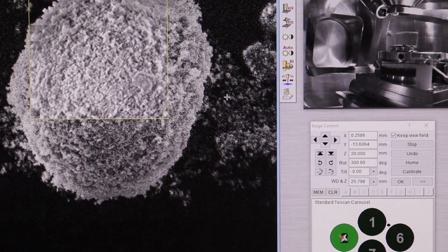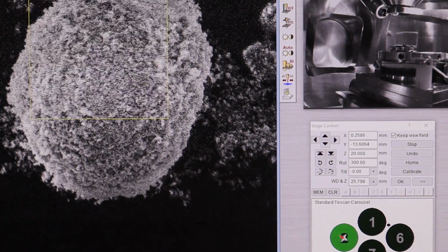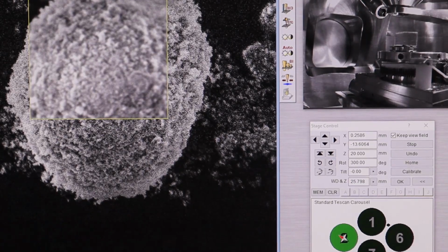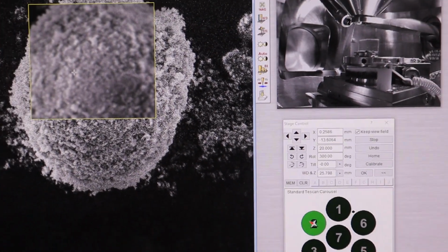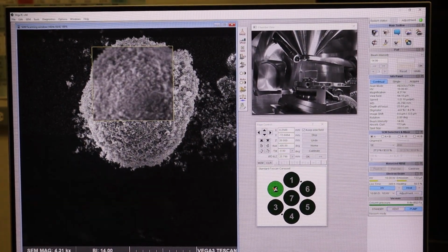On the opposite end, if we increase the beam intensity, right? So I will increase it. See, we lose noise, right? So the image is less noisy, but we lose resolution because the beam is now a wider diameter. So we get more signal, but we get less resolution.